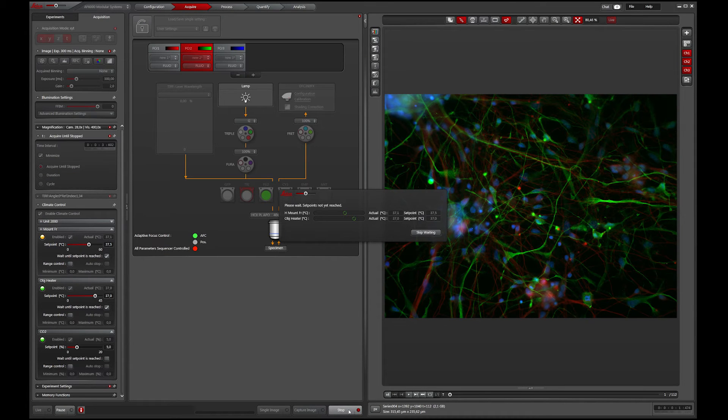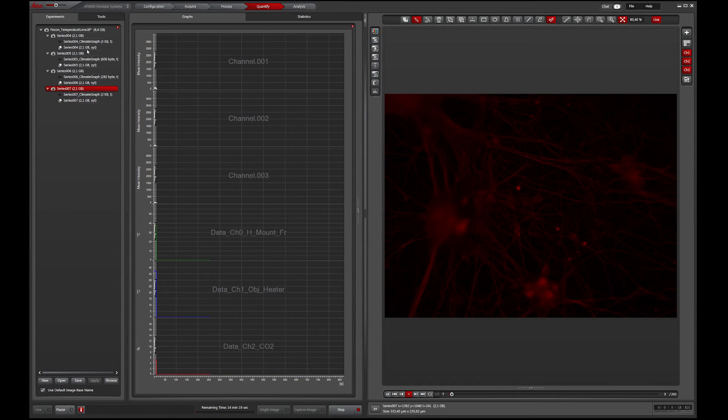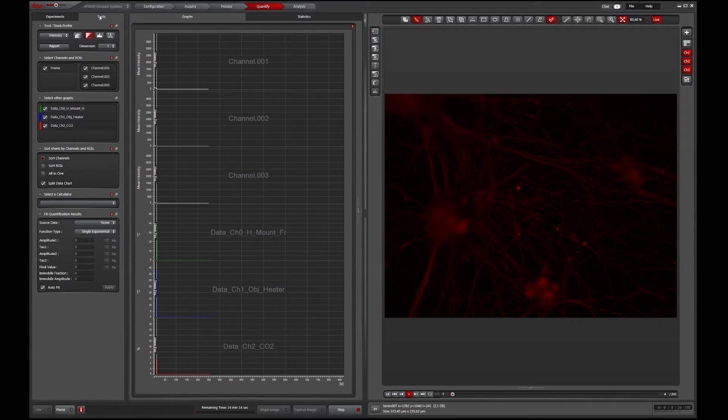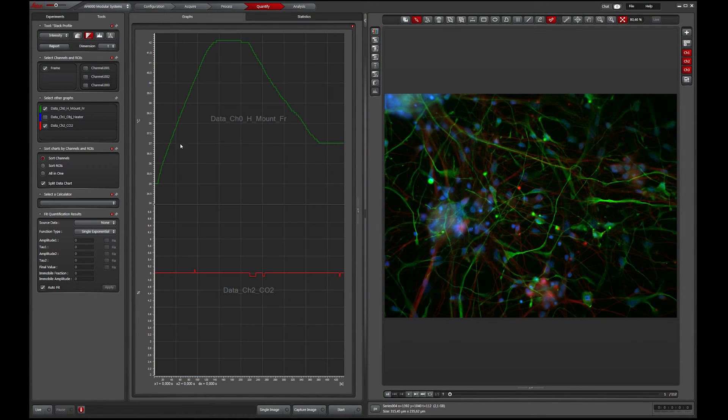Activate Range Control to get a warning when upper or lower limits are exceeded. All environmental data is saved within the experiment and can be monitored live or reviewed afterwards.